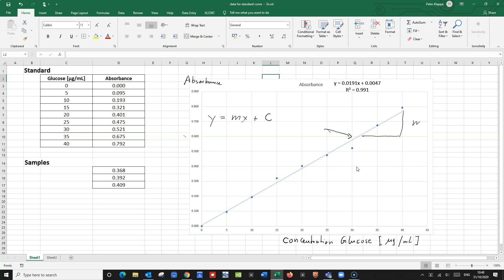So M is the gradient and C is the intercept. We have been given the equation here, so we know that our gradient M equals 0.0191 and the intercept C equals 0.0047.